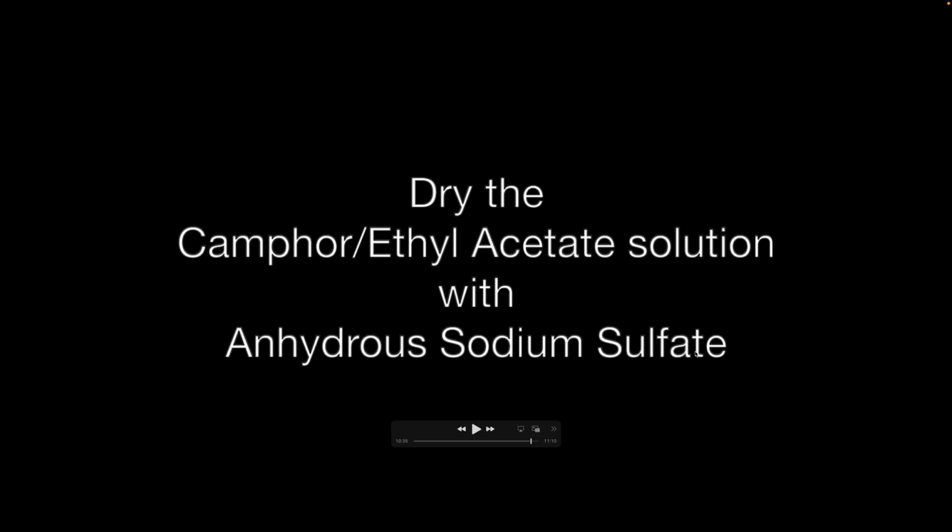Before sodium sulfate has absorbed any moisture, it's called anhydrous. Oftentimes they'll take the sodium sulfate and heat it up so any water boils away. That'll make it anhydrous. You can see the word hyd here, and that's referring to water, like if you're hydrated, you're drinking water. The prefix a or an in Greek means not. So if something's not typical, it's atypical. And here, because this starts with something that sounds like a vowel, they add the n. So anhydrous just means there's no water on this, and that means it's going to be able to soak up a lot of water.